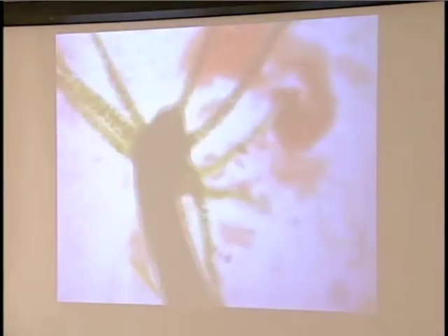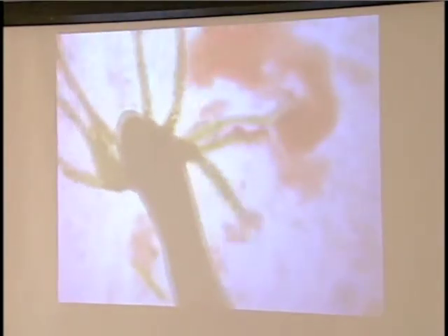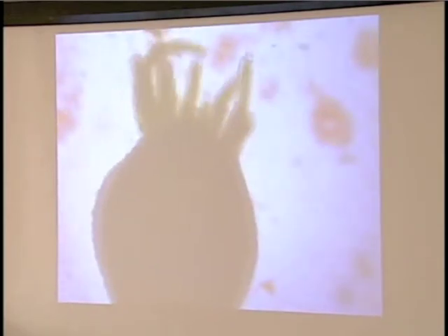There's actually a cavity they call gastrovascular. Just some more names. But so do you think it's really putting? Whoops. Like a big clump. You think so? I think it takes time is what I found. I have a question about that. Oh, he's not happy, but we're not making him happy here right now. He's all bunched up. So yeah, what do you think? Do you think he really is? This one is really hard.